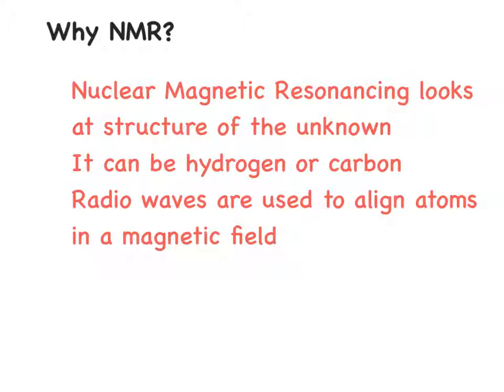And in both cases, we actually use long wavelength radio waves to align atoms inside a magnetic field. And this produces a pattern or a spectra that we can actually then analyse.